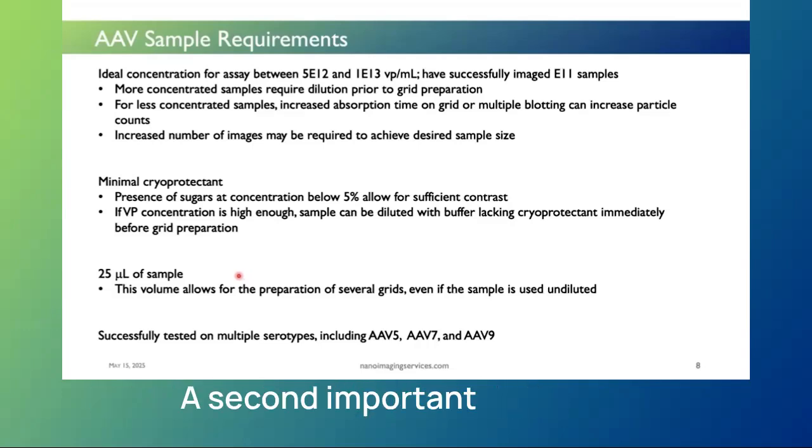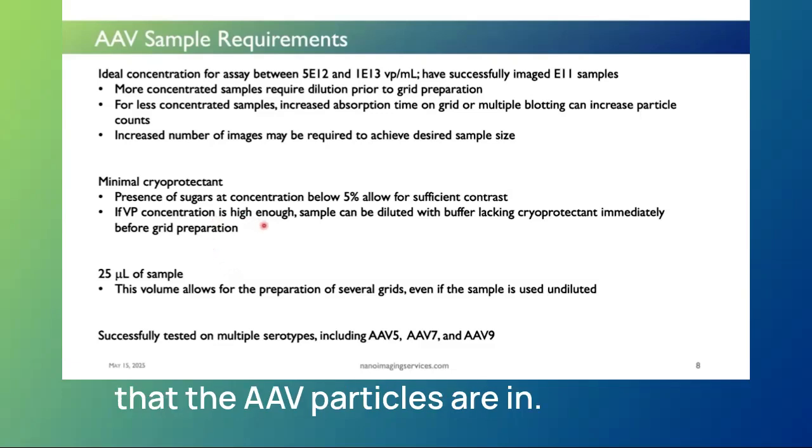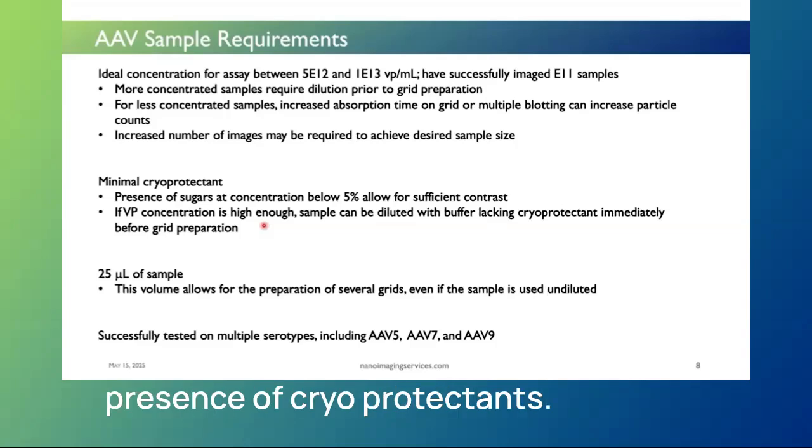A second important consideration is the buffer that the AAV particles are in. The most important aspect here is generally the presence of cryoprotectants.